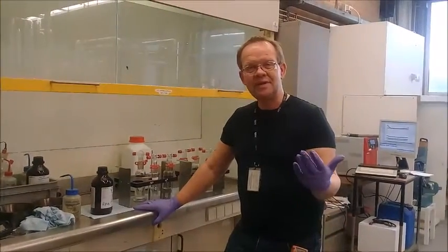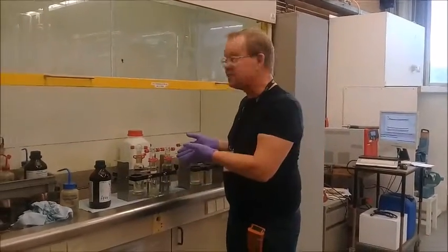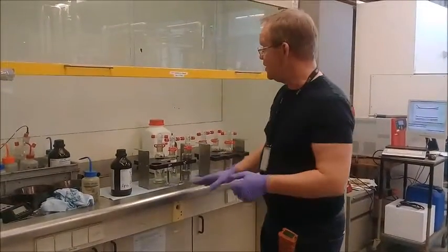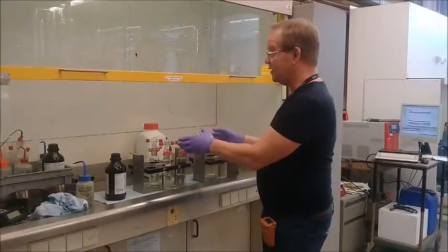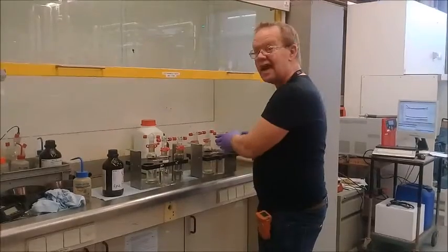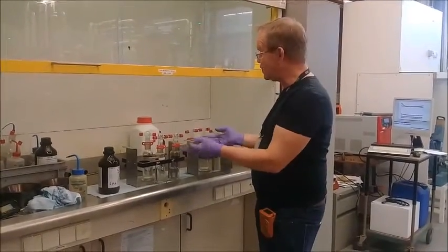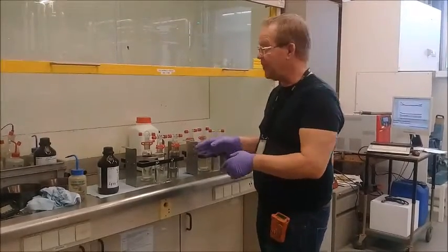Well, ladies and gentlemen, here we are again, and we now are going to process the samples coming from the baths. So here we have the 2 racks again, the rack from the water bath at 40 degrees and the rack from the glycol bath from minus 20 degrees. And we will put the samples together in one bottle.